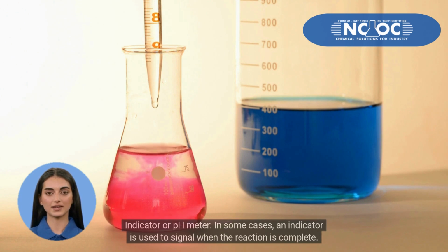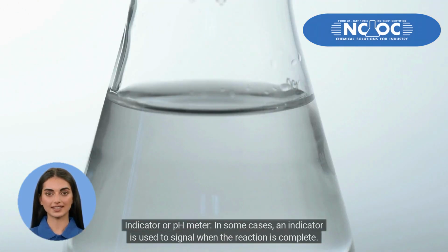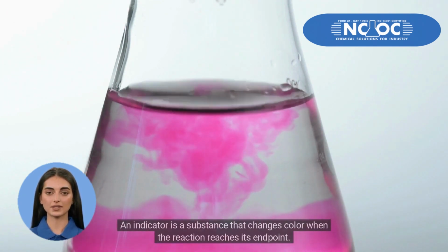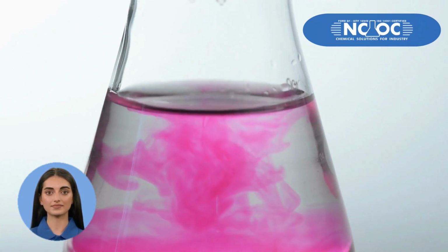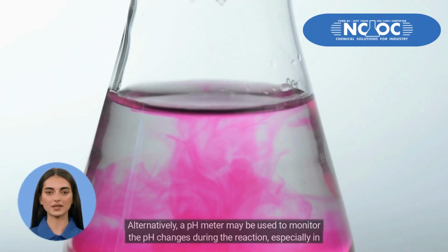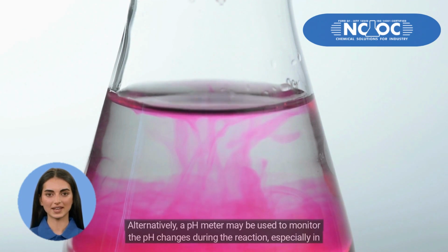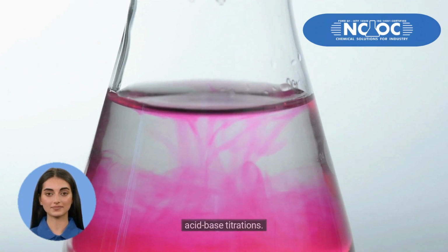Indicator or pH meter: in some cases, an indicator is used to signal when the reaction is complete. An indicator is a substance that changes color when the reaction reaches its endpoint. Alternatively, a pH meter may be used to monitor the pH changes during the reaction, especially in acid-base titrations.